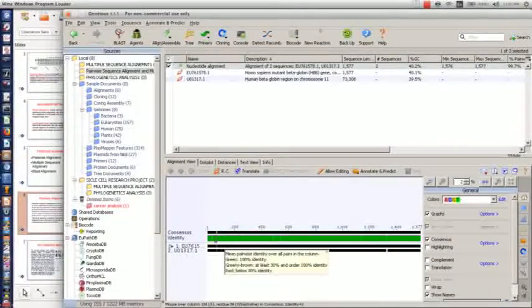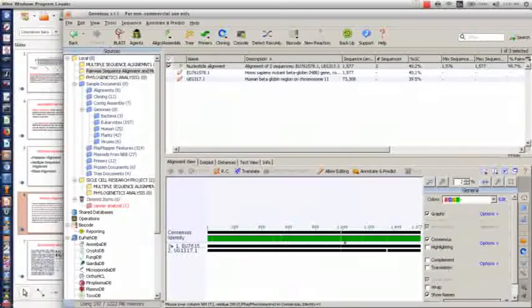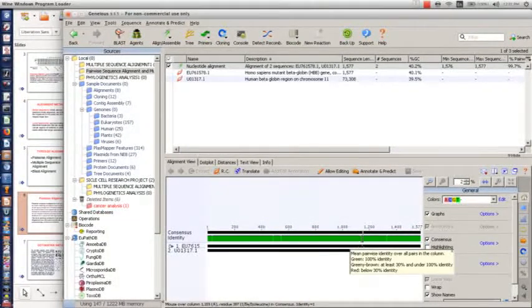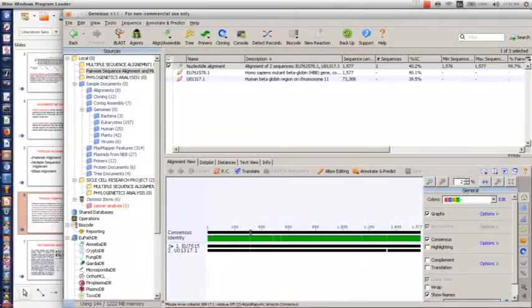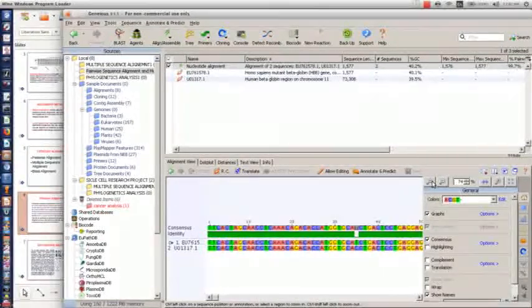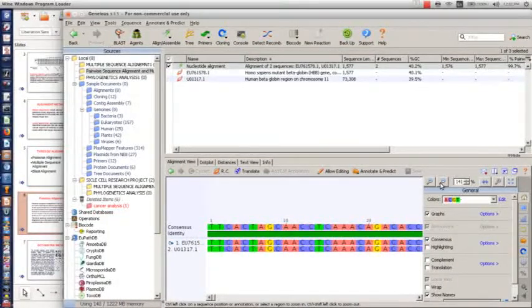Remember I told you from here to here, as you can see, there's no issue, there's no alteration, there's nothing. So this is just to tell you that this area is highly aligned. From here to here, highly aligned. Only this area is not aligned, this area is not aligned, this area is aligned. So we're going to be studying various issues related to these pairwise alignments when it comes to mutation analysis. So all you need to do now is zoom. Yeah, so here we are.